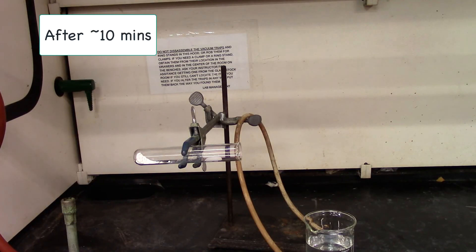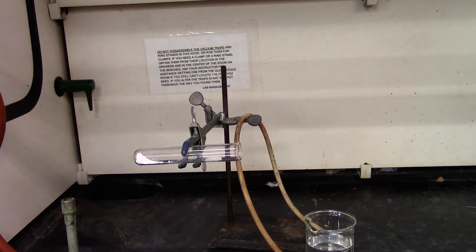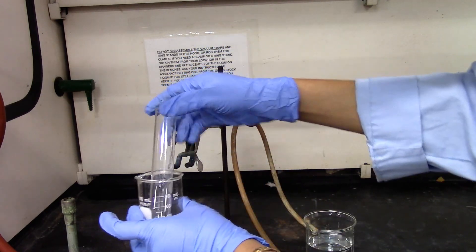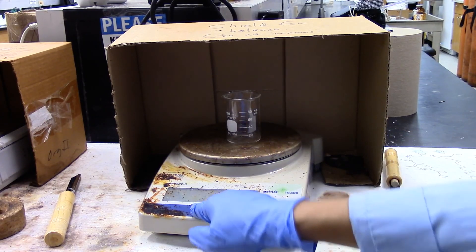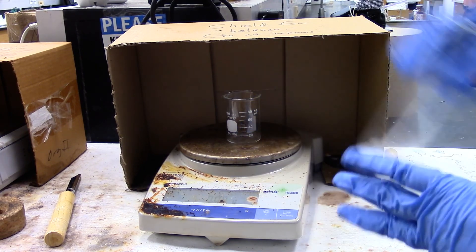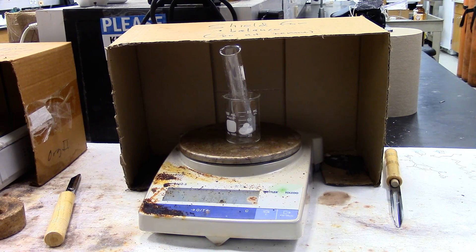The test tube has cooled down. We'll go ahead and weigh it in the balance. Place the beaker, tare the balance, and then place the test tube with the product.